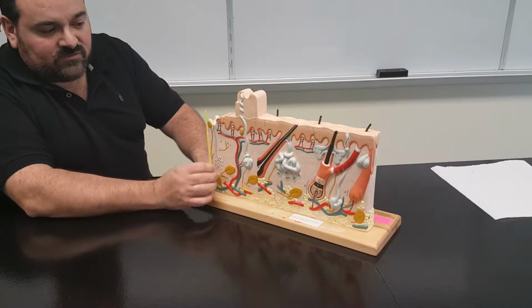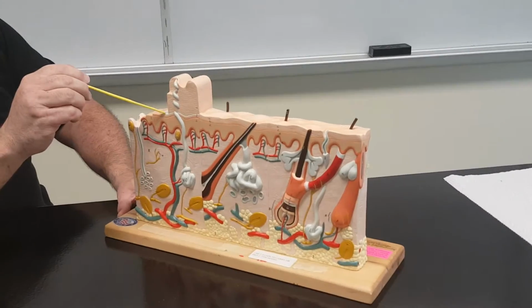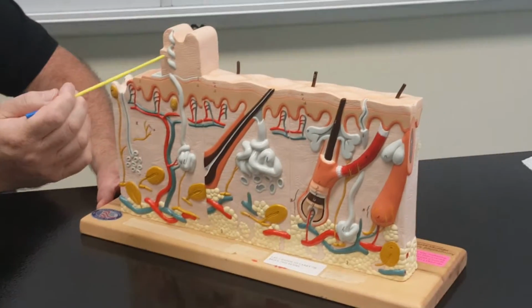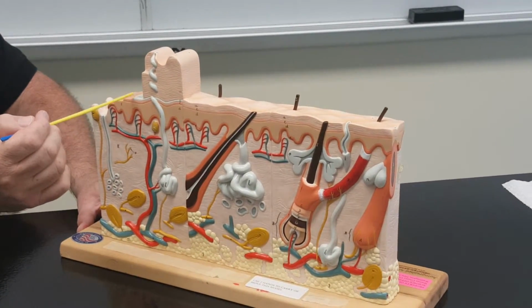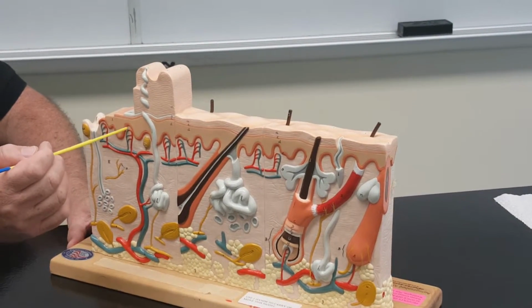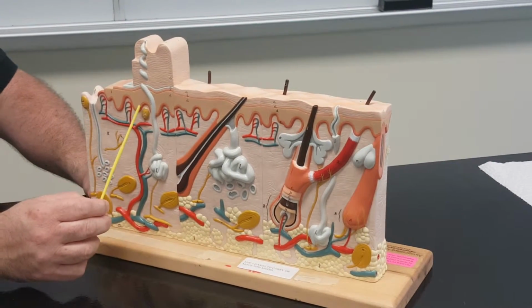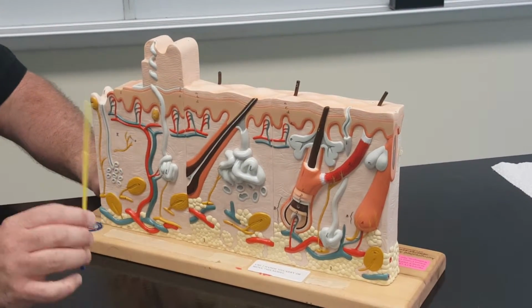Palms of your hand, the soles of your feet, thick skin. You'll see that it contains this white layer right here of the epidermis, the lucidum layer. So we have corneum, lucidum, right? Granulosum, spinosum, and this is the basal layer, okay? That orange. Now, so that's the epidermis, okay? Stratified squamous epithelial tissue, keratinized.